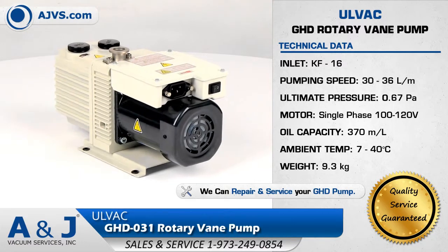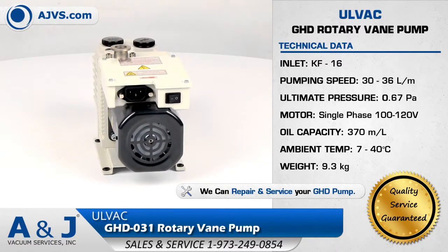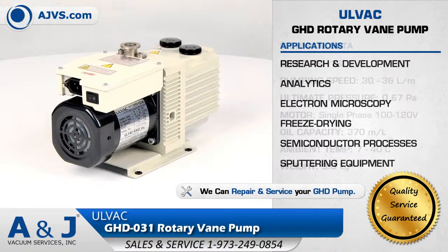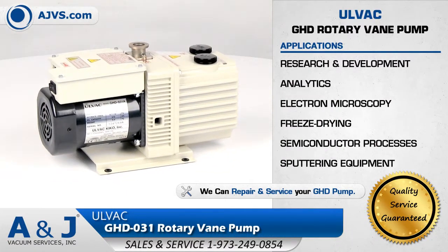Making it an efficient rotary vane pump for today's most demanding work environments. The Olvac GHD Rotary Vane Pump Series is a highly reliable and low-maintenance high vacuum solution for applications in research and development, analytics, and helium leak detection.